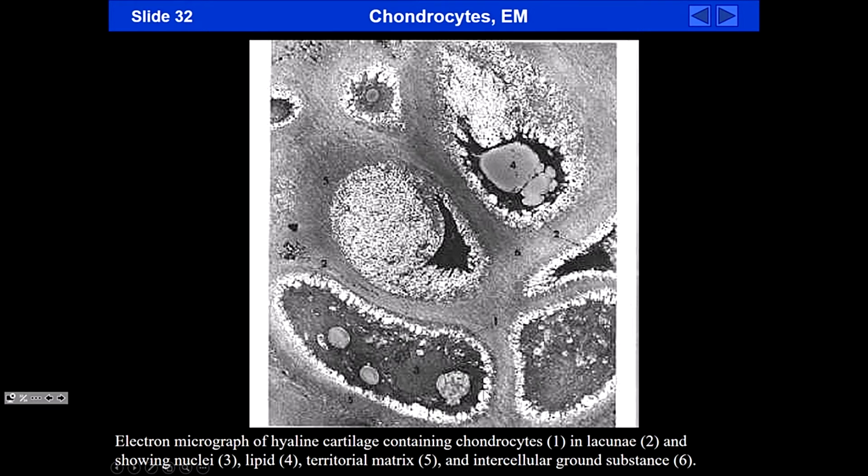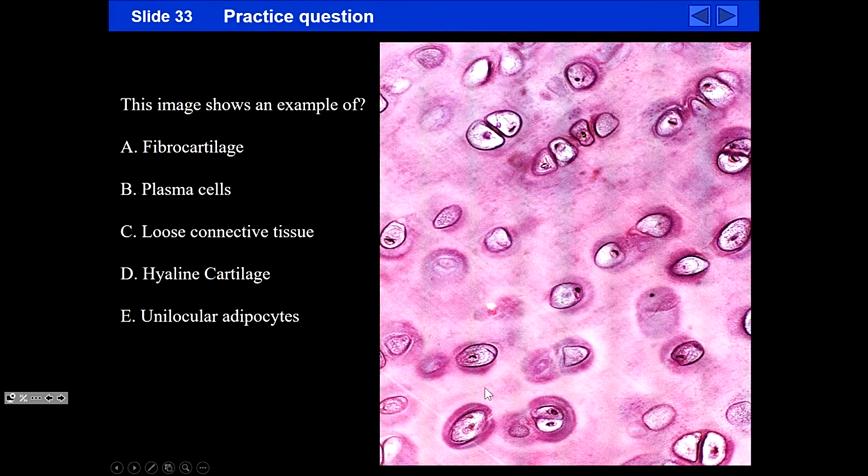So then we would say, okay, if this is cartilage, because we can see this ring around the cytoplasm, these would be older cells of the chondrocyte variety. It's a trivial distinction between a blast and a cyte. It's basically that ring around the cytoplasm. Any questions? Okay, that was it. That went pretty quickly.